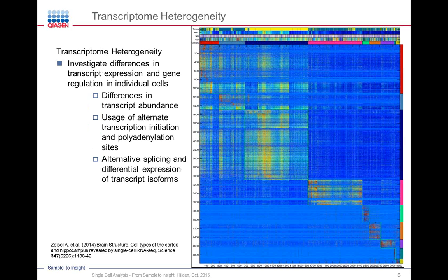That's only if you're looking at, of course, genetic variation, but you can also look at transcriptomic variation. The changes in a genome that one cell will have versus another can, of course, manifest as changes in a transcriptome. So, for example, you might have a single nucleotide polymorphism in a transcription factor binding site. This can then, of course, affect the transcriptome in that this transcript may not be expressed in one cell versus the other.